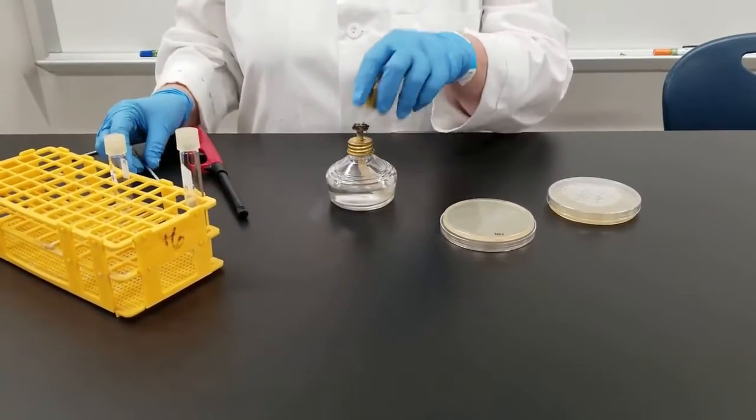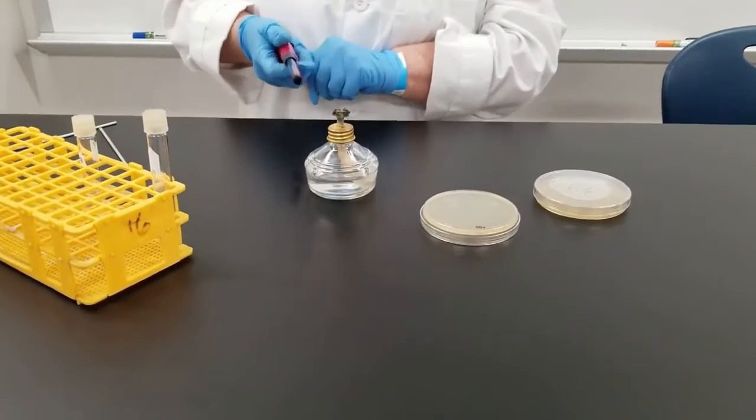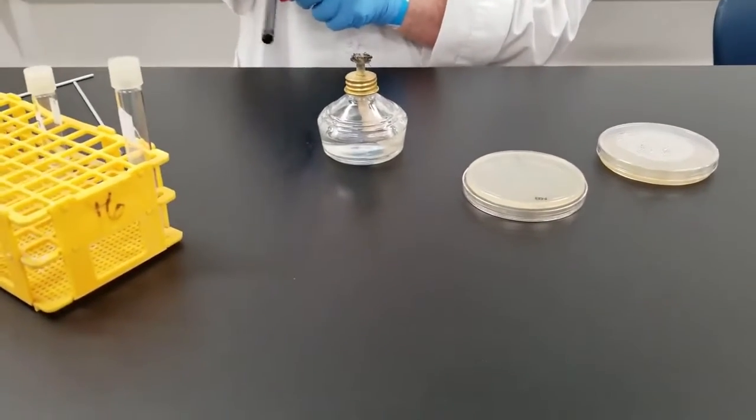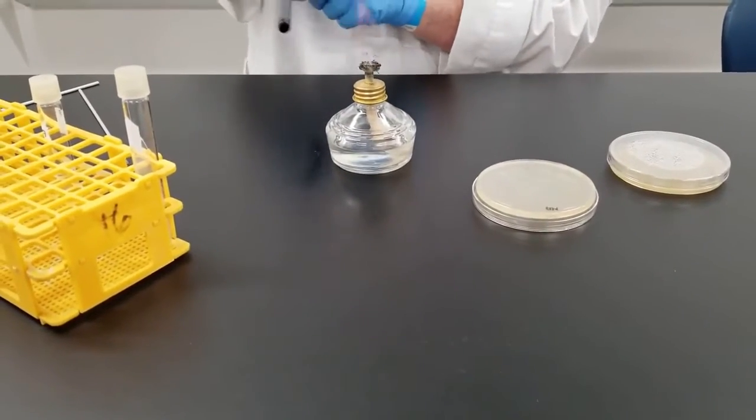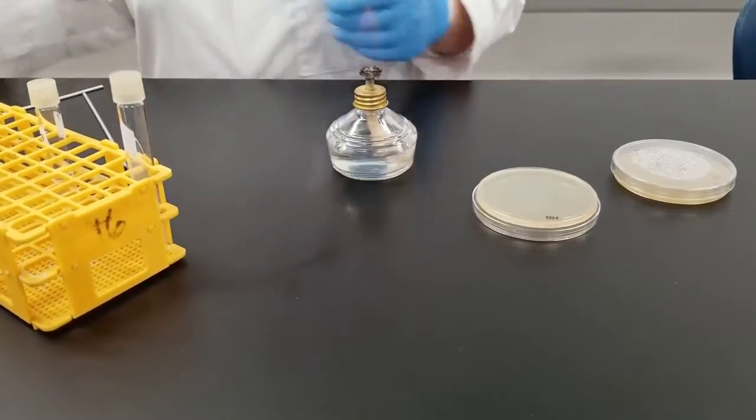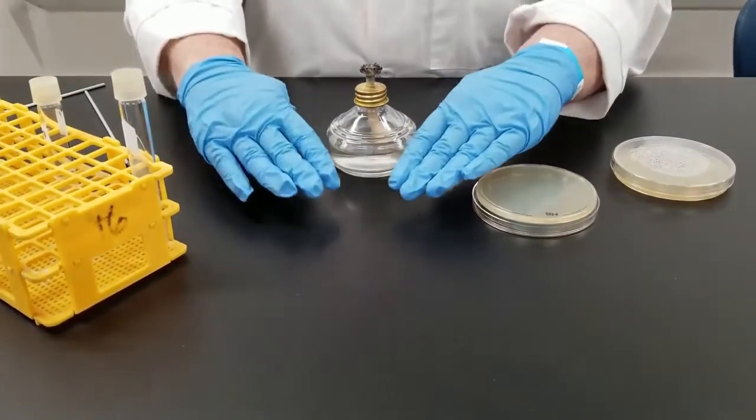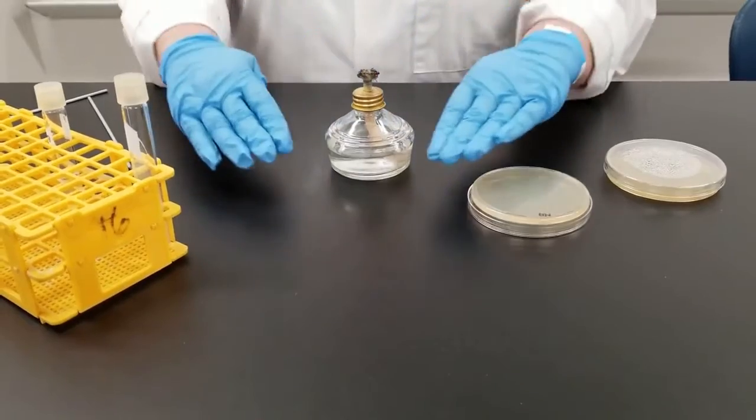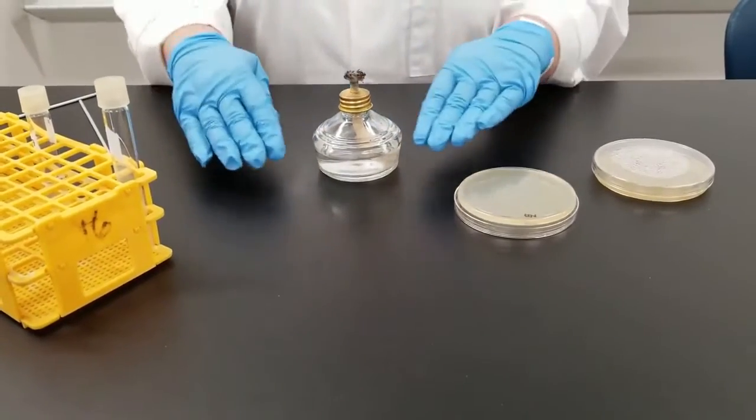Now we're always going to be working with the flame and working near that flame. General rule of thumb is that within about six, no more than eight inches around that flame is considered your sterile area.